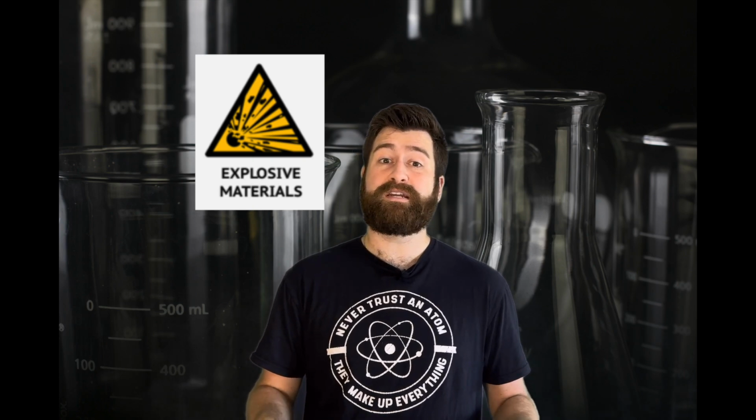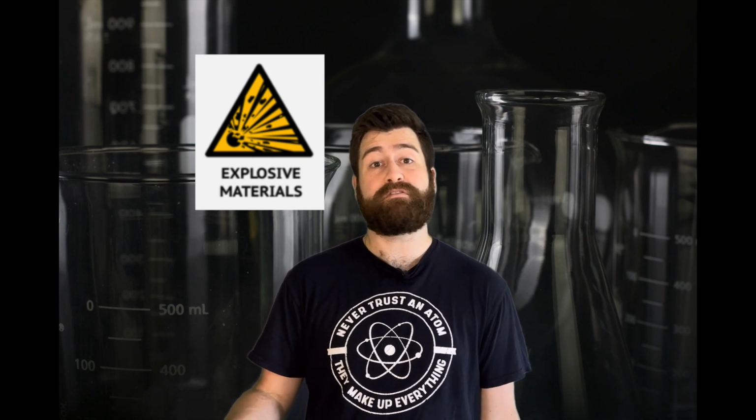This symbol means that the material may be explosive and you should avoid contact with things such as open flames or other reactants that can set it off. Now, besides safety symbols, labs also have rules that you should make sure that you're following, again to avoid harming yourself or others accidentally. Some general lab safety rules are as follows.